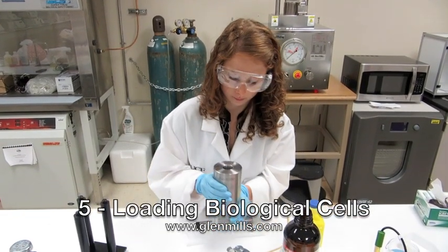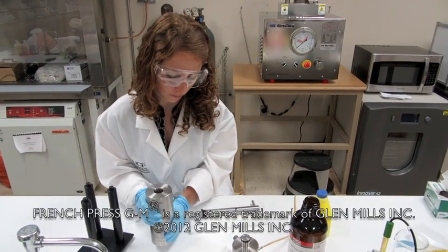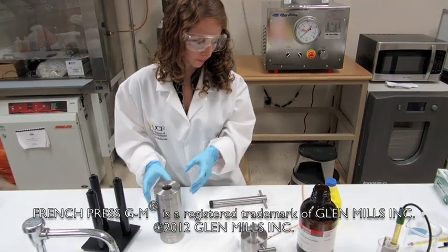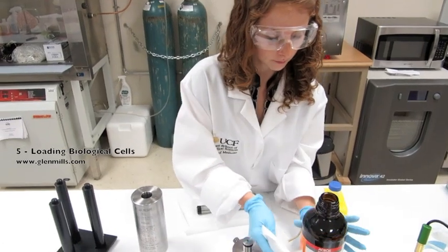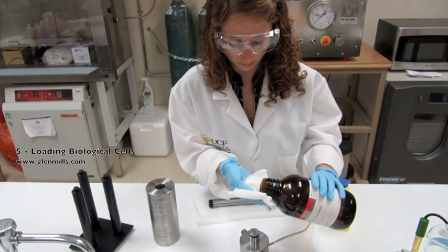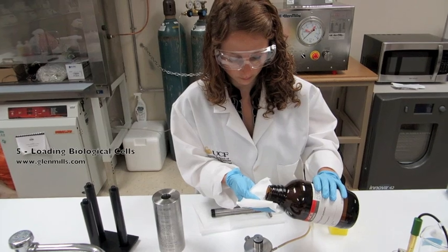Remove the closure plug from the cell body and lay aside for now. Lubricate the piston's O-rings with water, silicone, glycerol, or other acceptable materials to facilitate its movement into the cell body.